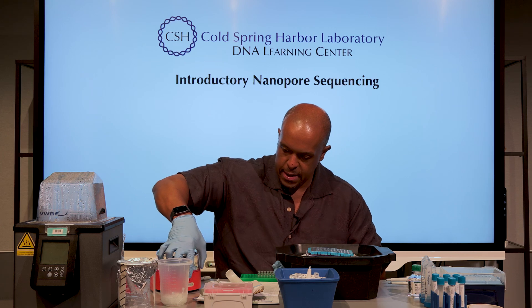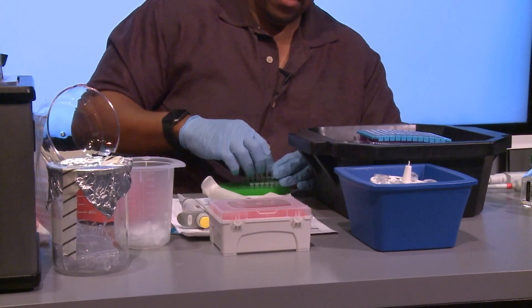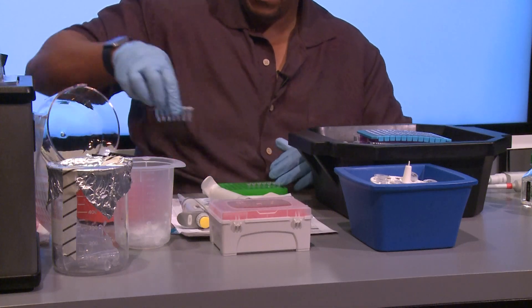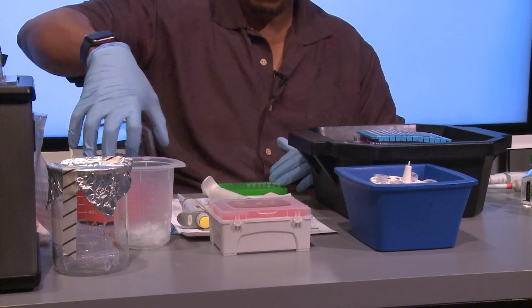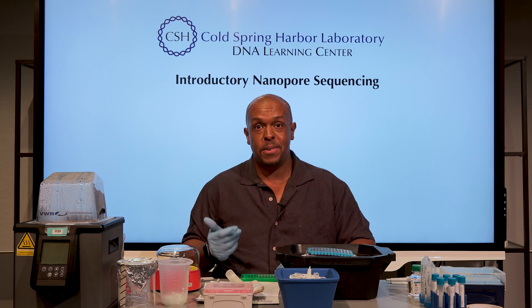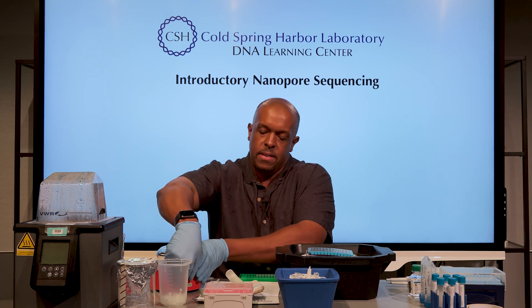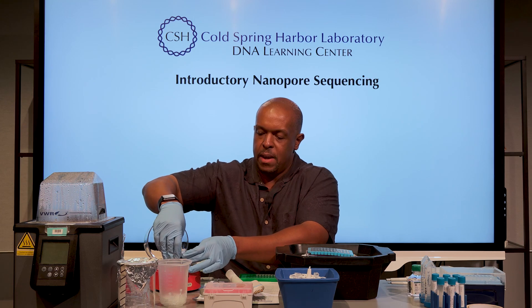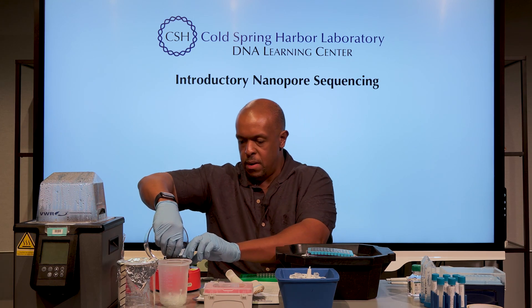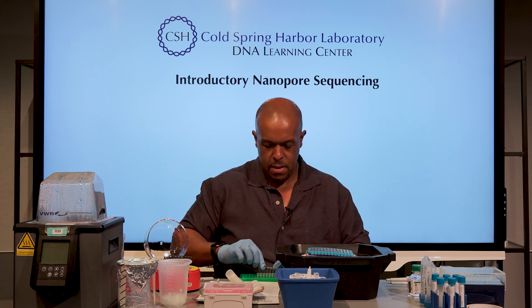I happen to have one of my little plate spinners today. For the primers, if you notice that the liquid is on the side of the tube, you can always use a plate spinner. Really, if you don't have a plate spinner — because we're trying to avoid unnecessary tools — a couple of quick taps is usually enough to get it all to the bottom. I didn't have any problem today, so all looks good. We end up with about 50 microliters here, and I'm visually checking to make sure everything looks to be the correct volume.